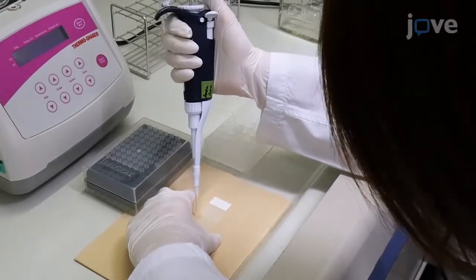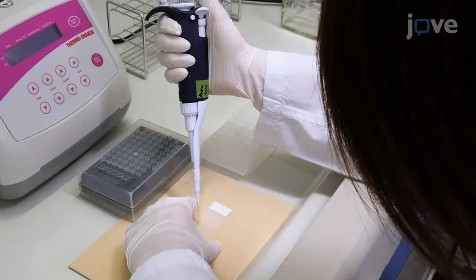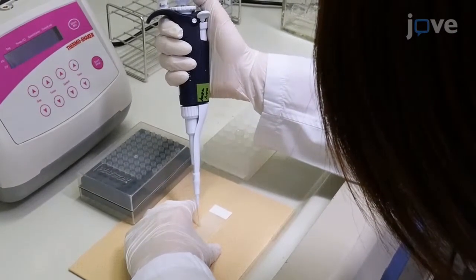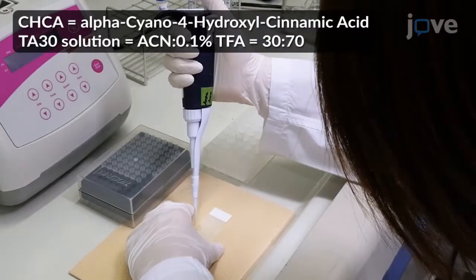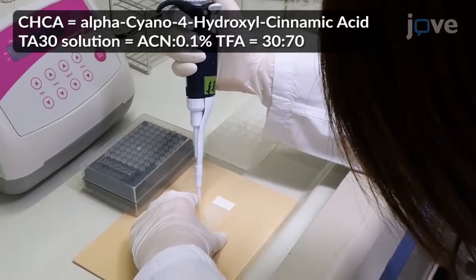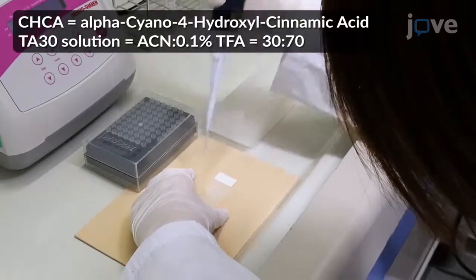To make the calibration standard, dissolve the peptide calibration standard and the protein calibration standard in a 1 to 4 ratio with CHCA in TA30 solution and then dilute it 10 times. Place 1 microliter of calibration standard on the slide at 4 different locations.